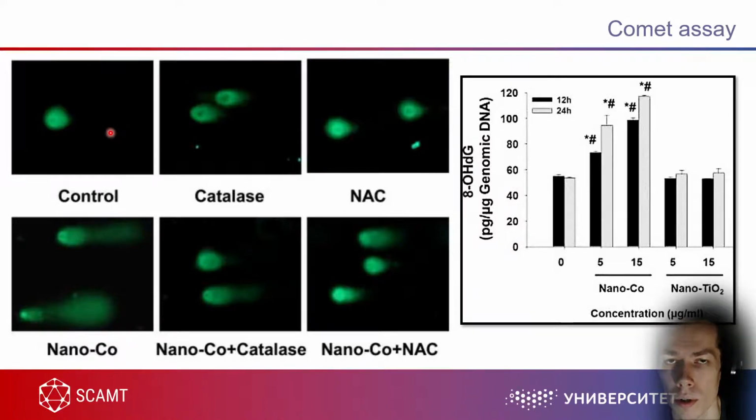your cells in agarose gel, like a gel electrophoresis, but for a whole cell. And if you have some damaged DNA, this means that this DNA has lower molecular weight because it's damaged, like cleaved or something like this. And this DNA will most likely exit, maybe not just exit the cells, but will move following the gradient of your electrophoresis. So in case of control cells, there is no comet tail, so they are called tails.